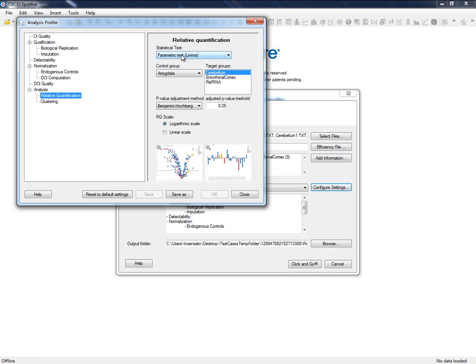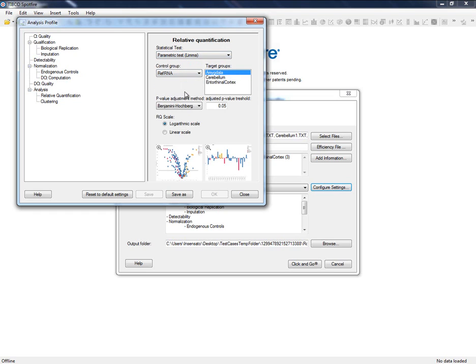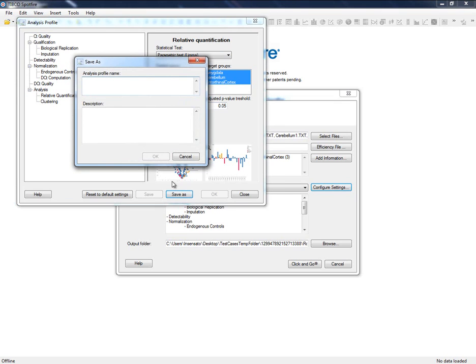This is the relative quantification study, or the RQ, that we want to perform. This is the group that we want to use as a control and compare to all the tissues. Let's save these changes so that we can use this configuration at a later date.